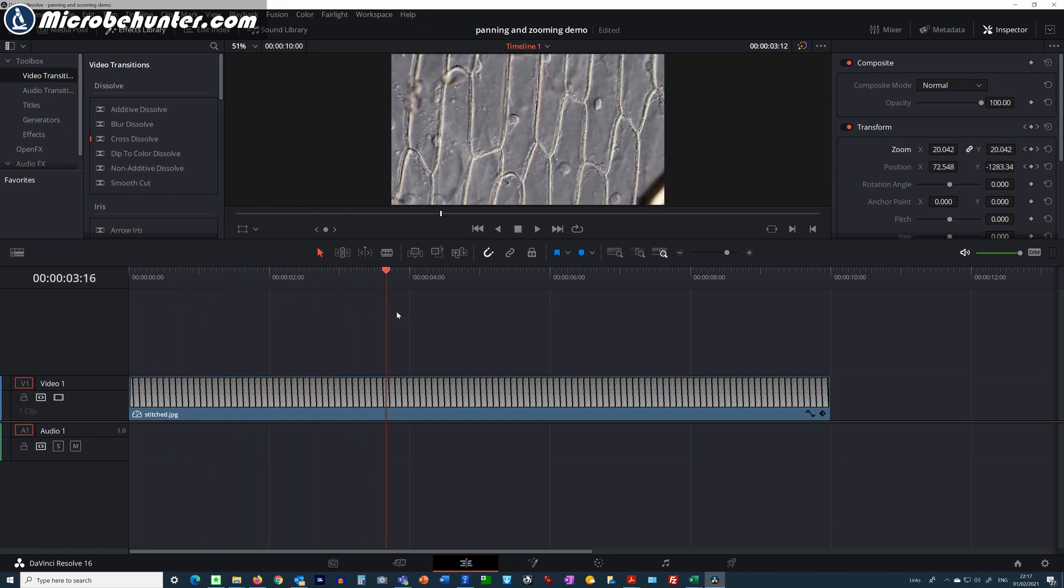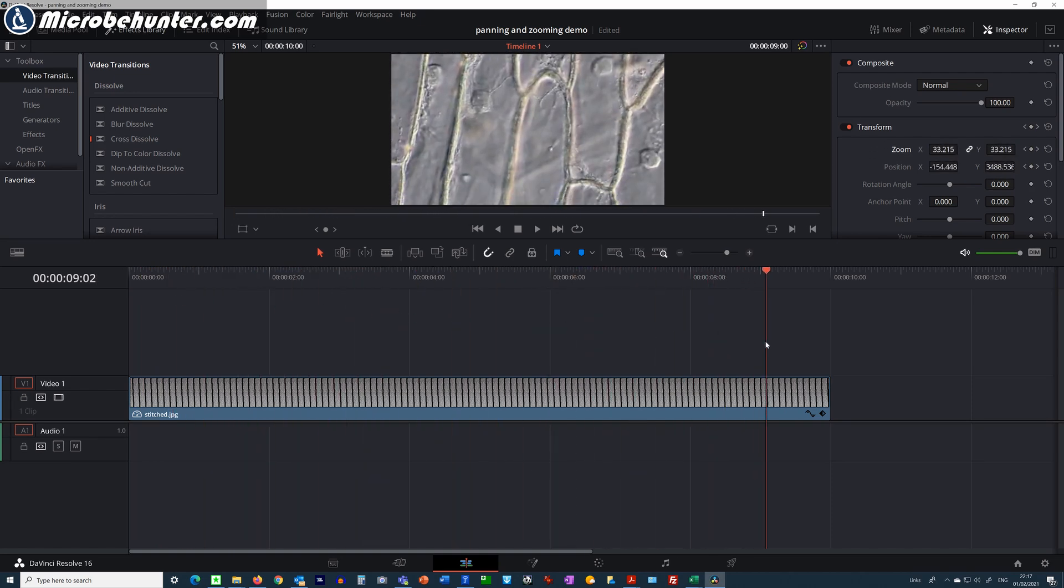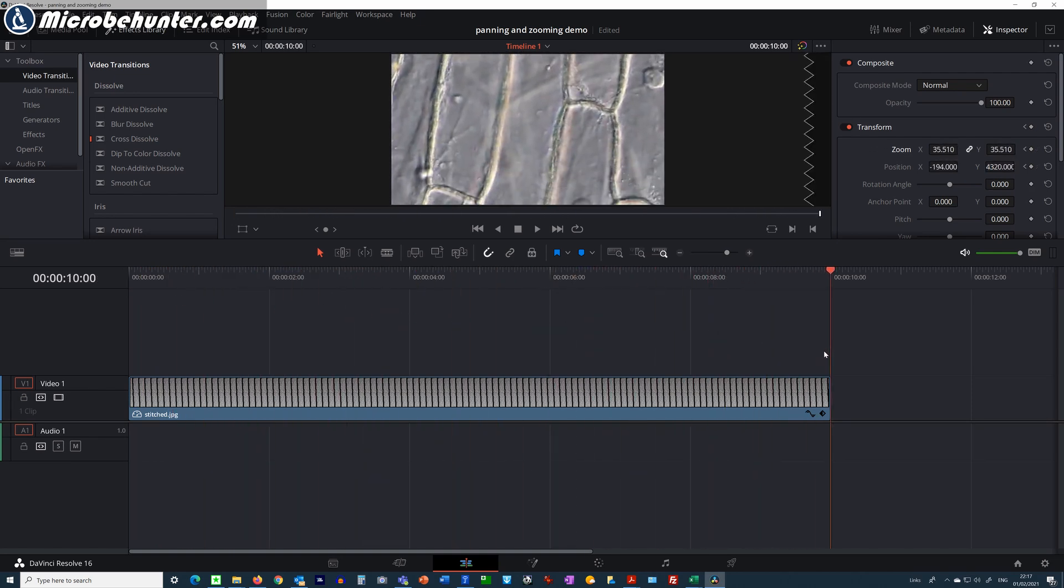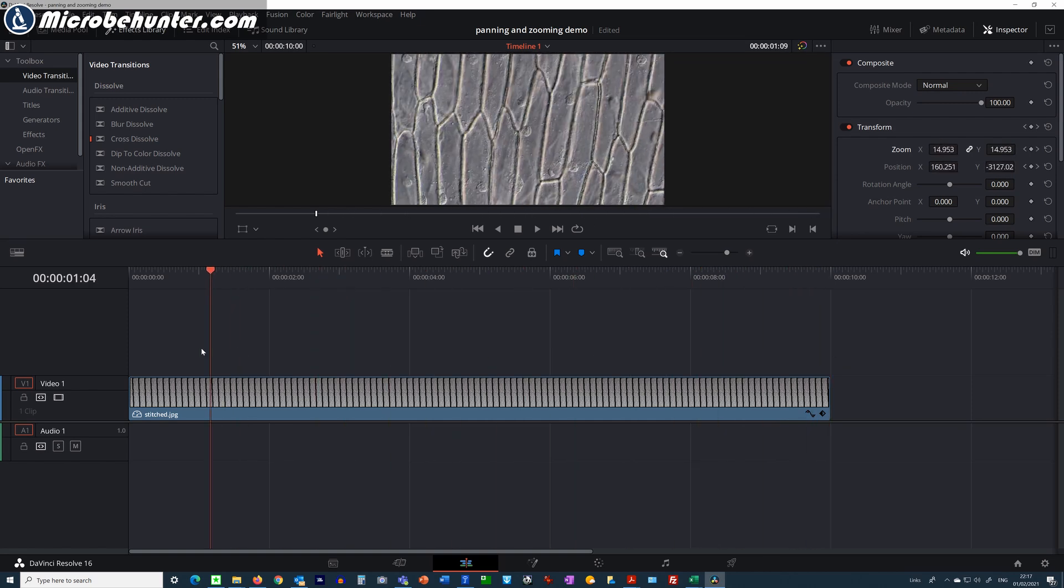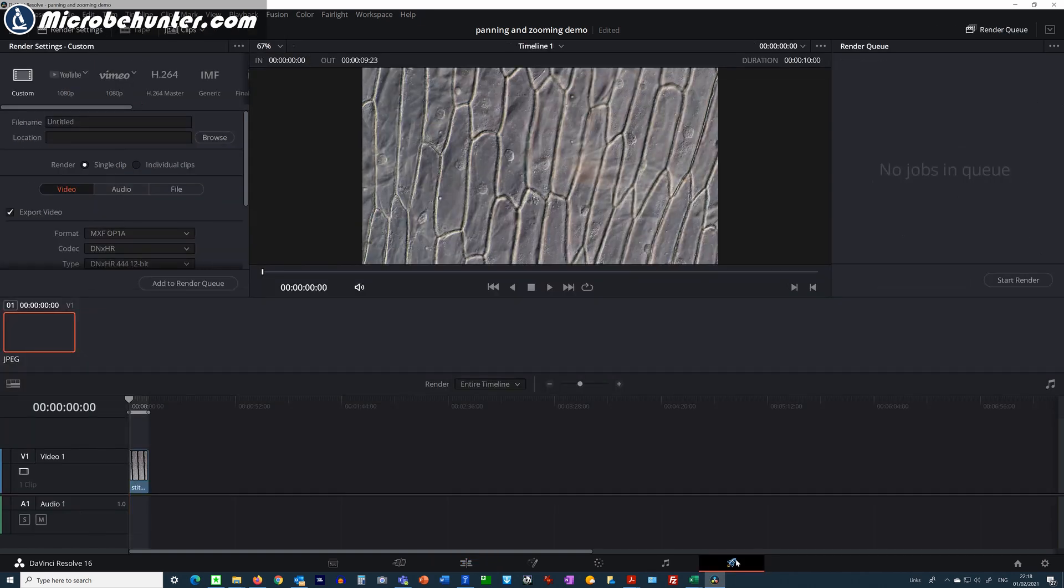I'm now able to export this file as an MP4 file and then I have a video. This is going to be perfectly smooth and much better than if I were to simply use the mechanical stage.